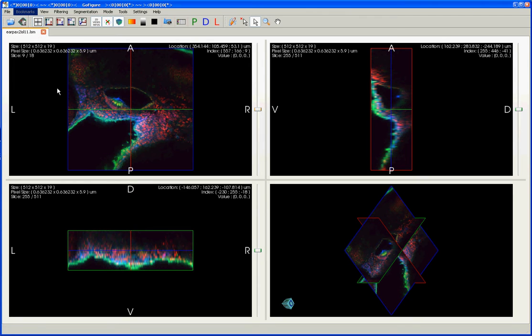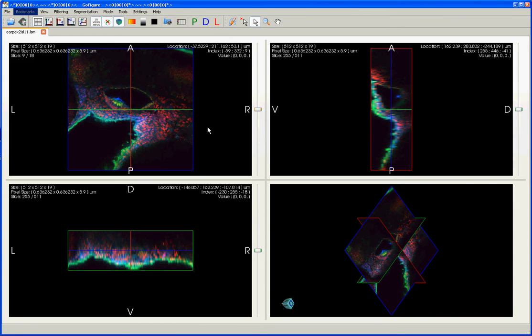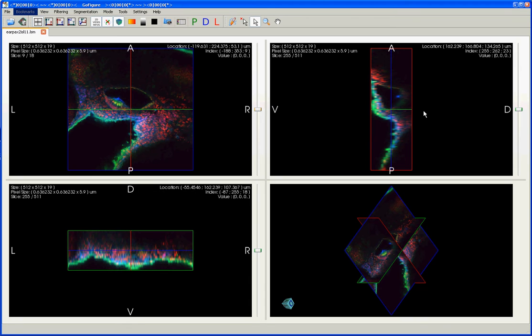Once you have your image open, you're immediately brought to the Quad view, which shows you the XY plane, the ZX plane, the YZ plane, and the 3D view at the lower right.